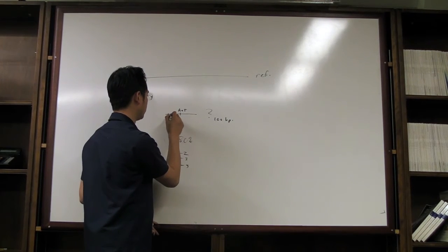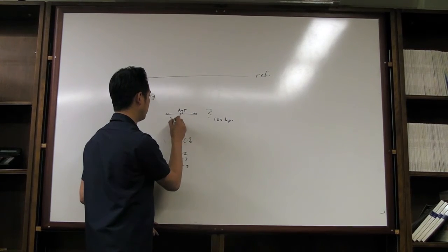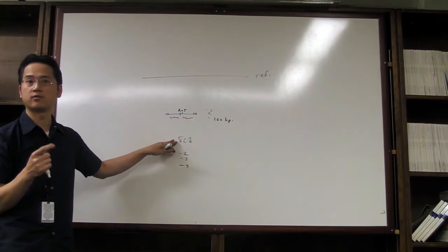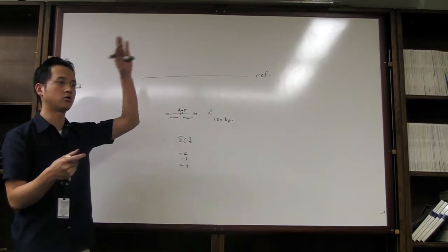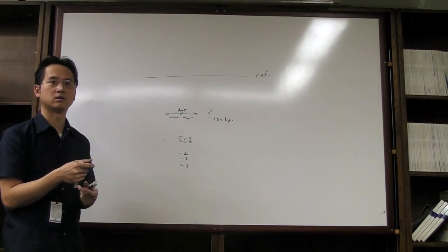So let's say you get rid of some of these bases here, some of there, some of here. In the end, hopefully 80% that's left matches to your genome, and that's a pretty good enough similarity to say, yep, that belongs somewhere in the genome on chromosome 2, in this portion of this gene, et cetera, et cetera.